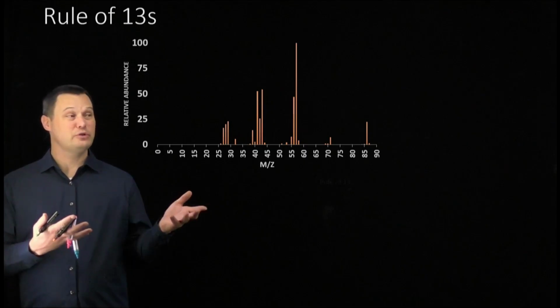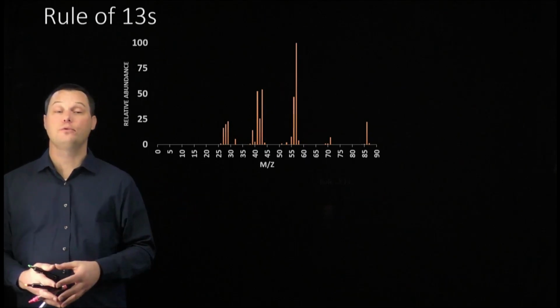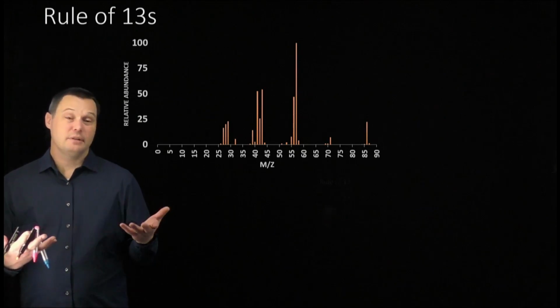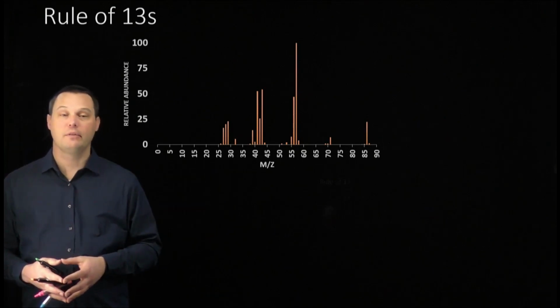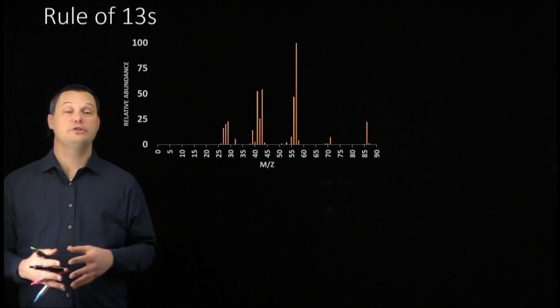In order to solve a structure from a spectrum, you really need a target to aim at. You really need to know what the molecular formula for the molecule could be. A lot of the times, instructors will give you the molecular formula for the molecule you're solving. Sometimes you might only be given elemental analysis data from a combustion analysis experiment.